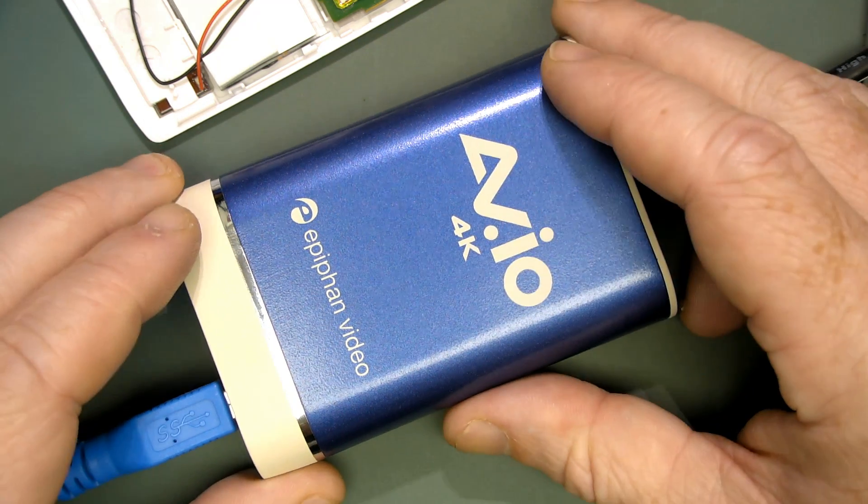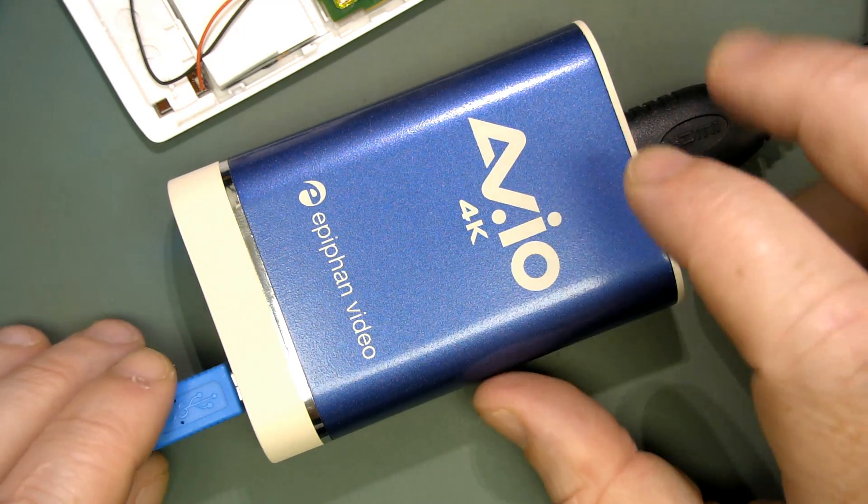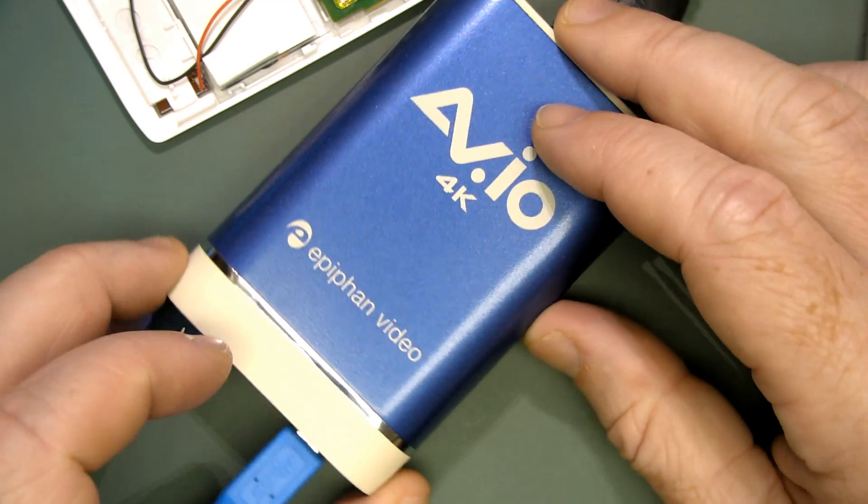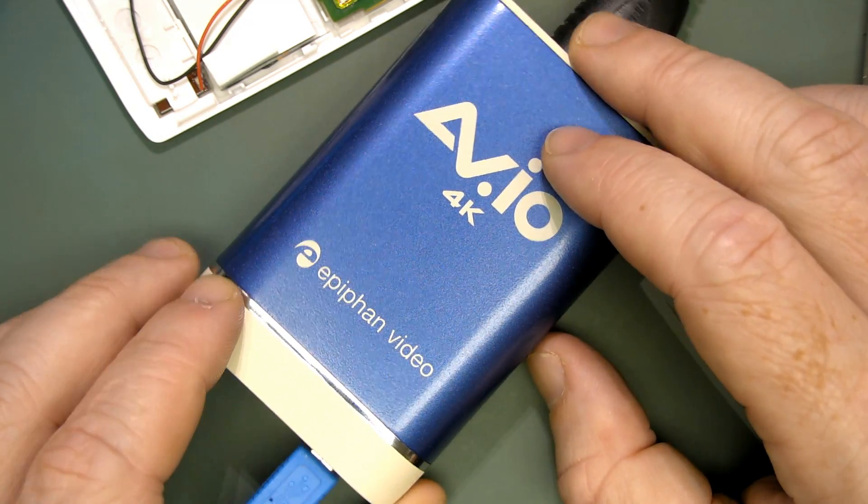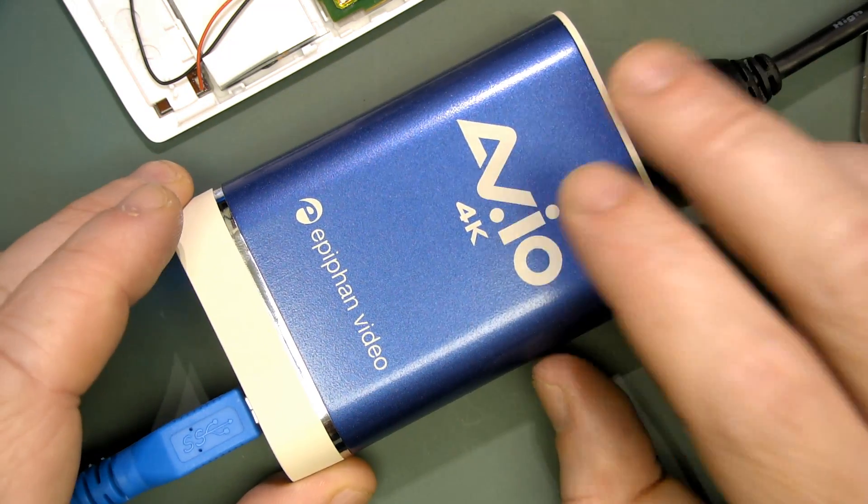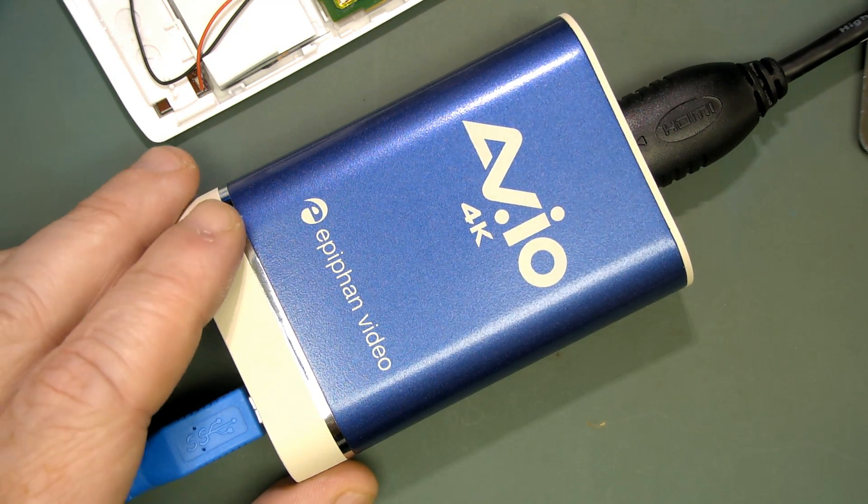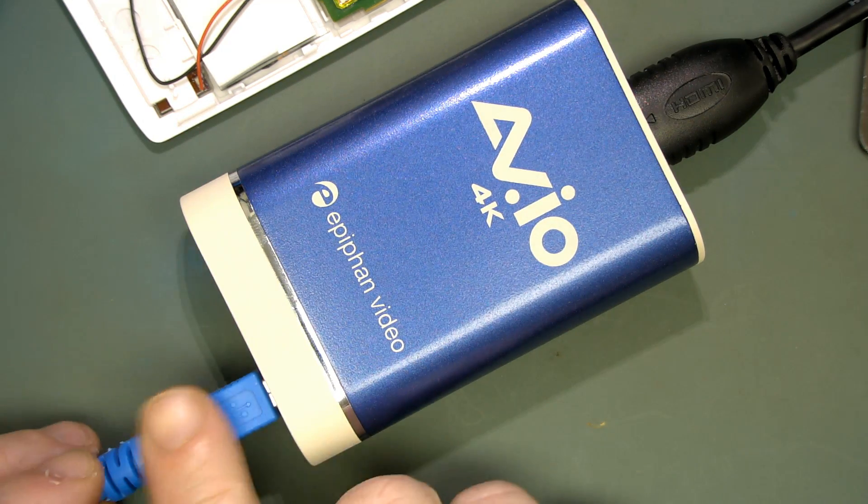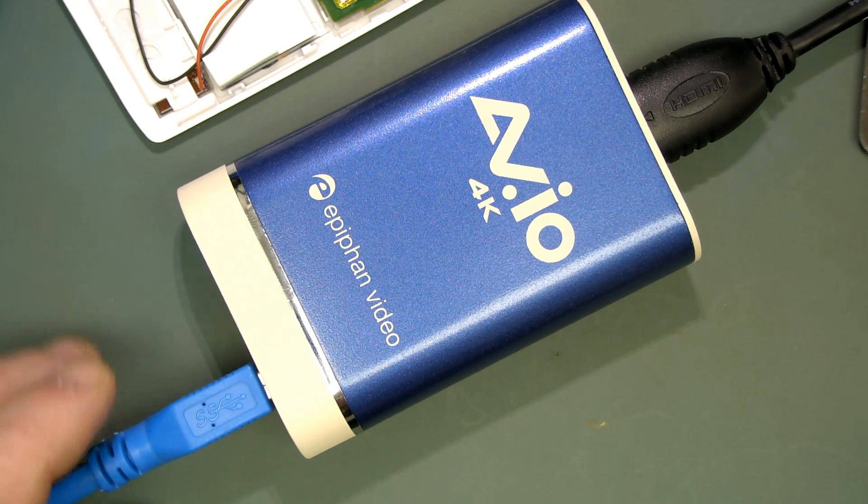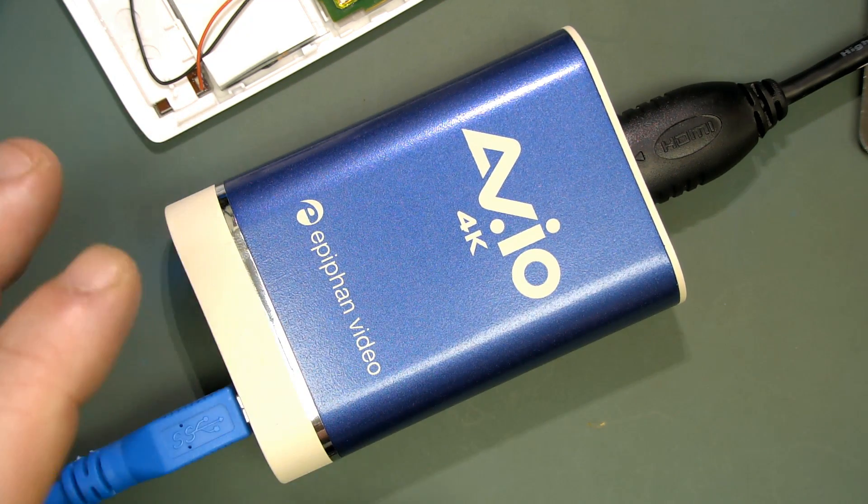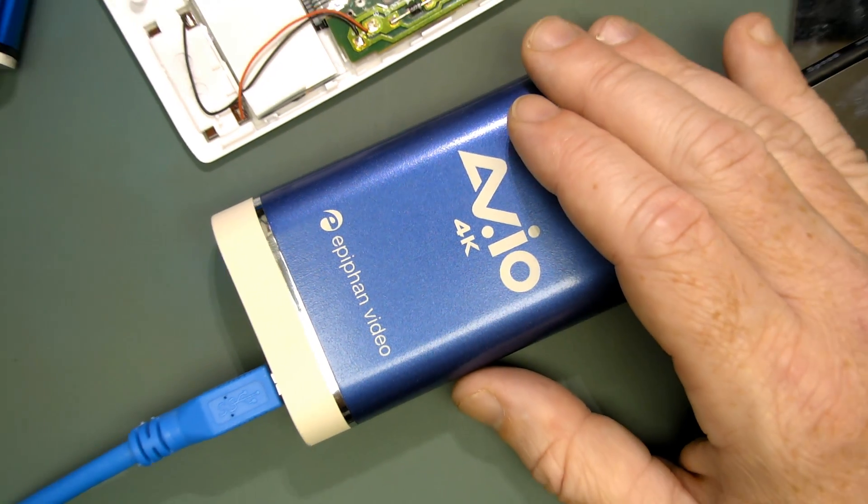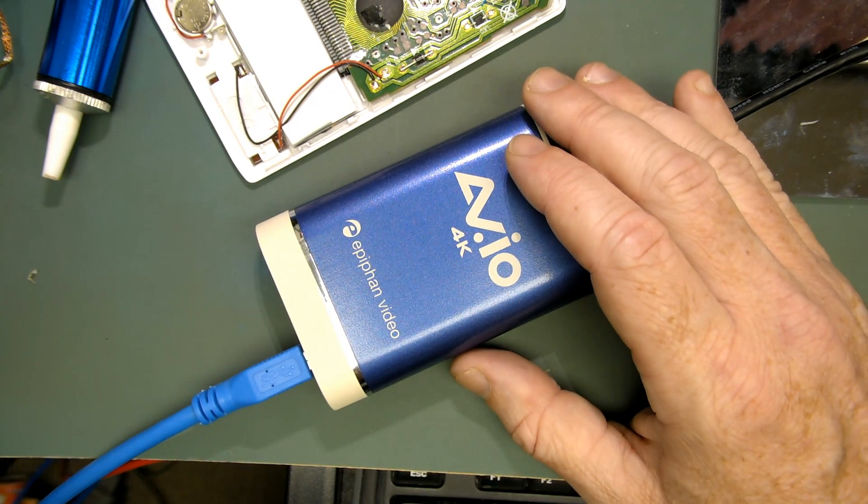Hi, this is a follow-up video to the previous one where I'm using this AV.io 4K Epiphan high-speed USB 3 video capture device with my Tagarno microscope as my video source.